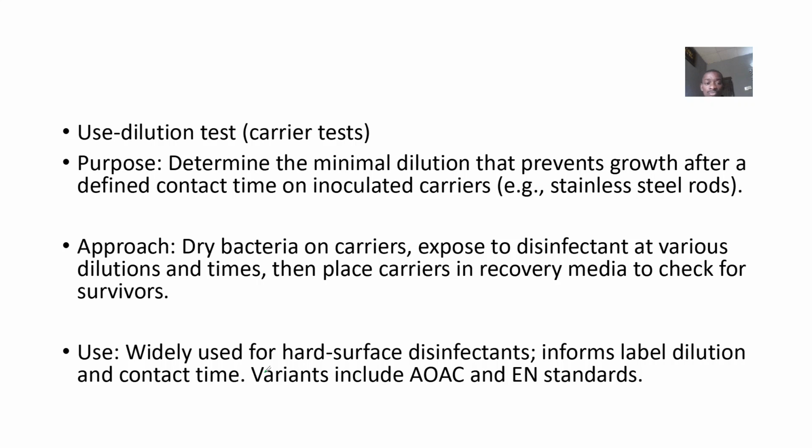So also we have the dilution test, also known as the carrier test. In this one, you determine the minimal dilution that prevents growth. Do you understand? What is the least? Then you can go a slight level above, so that you know it will work 100%. So the approach: you dry bacteria on carriers, and you expose them to the disinfectants at various dilutions and times. So you are basically checking, for this dilution did it work, for this dilution did it work, for this dilution did it work. So it's widely used for hard surface disinfectants and the rest of it.